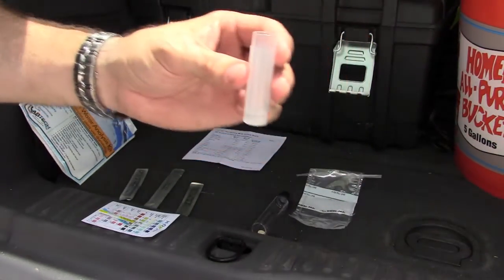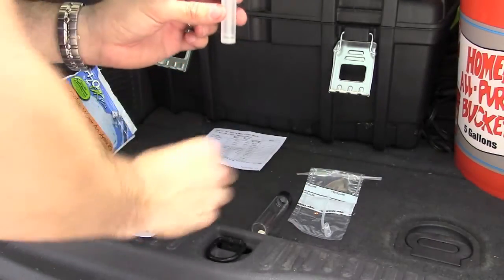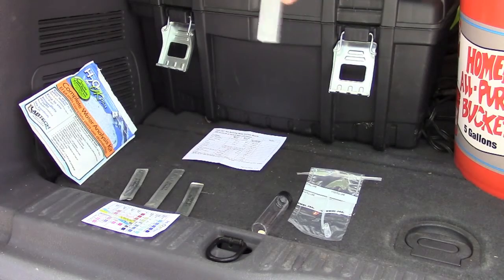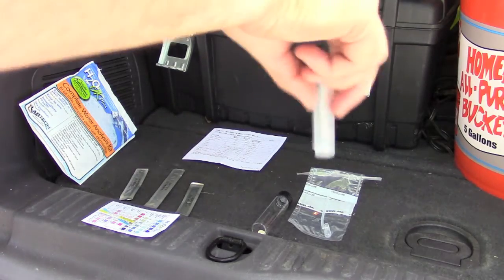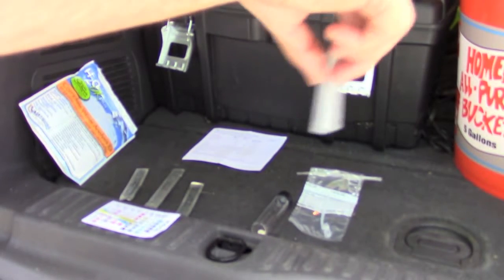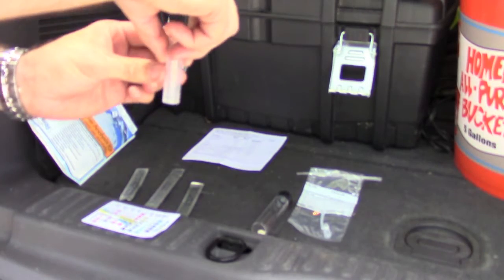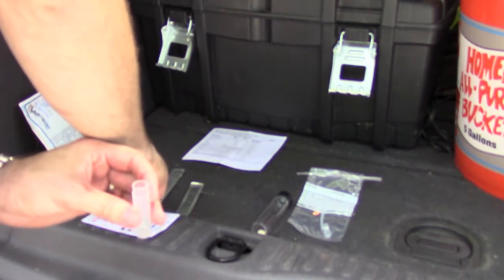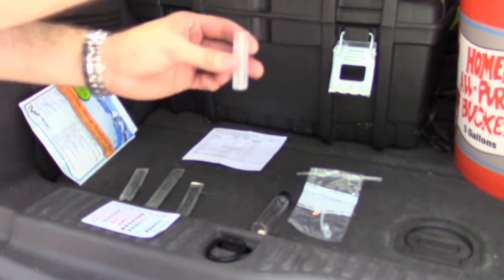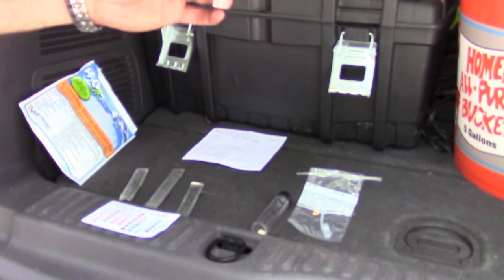That's all it calls for — two droppers full of water. Swirl gently for several seconds. Arrows pointing down — place both test strips inside, wait 10 minutes, do not disturb.